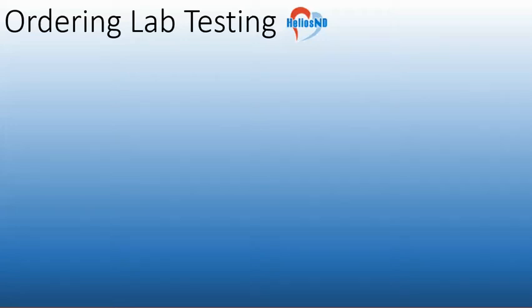In this video, we're going to look at how a lab order is created in Helios and how to review results.